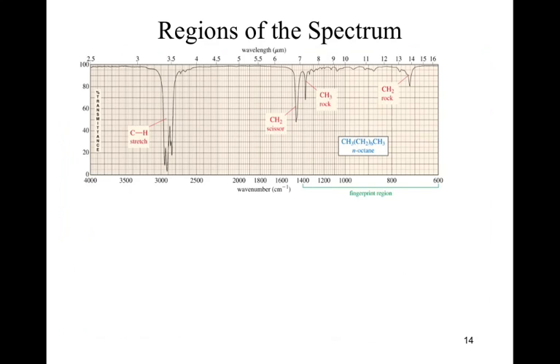To simplify, here's a real spectrum. You're going to be responsible for interpreting this spectrum. But if you take a look at this bottom section here, it says fingerprint region. The fingerprint region, much like our fingerprints, will characteristically identify a compound. But when you walked into the classroom, did you come up and ask to see my fingerprints to prove that I was the instructor for the course? Because, I mean, that's how you identify things, right? Through a fingerprint. Okay, we got other things.